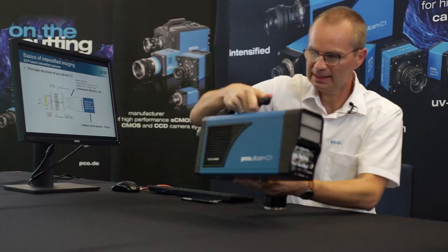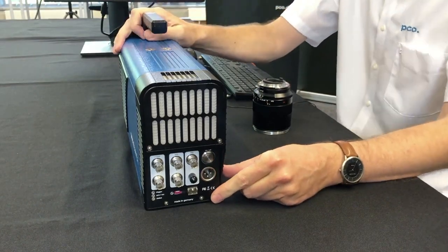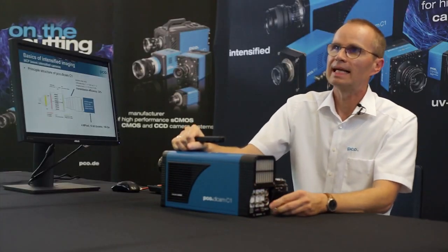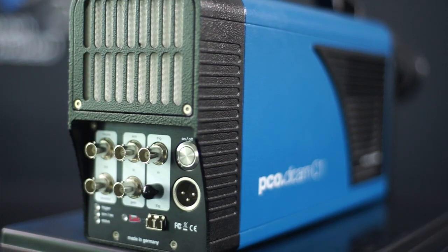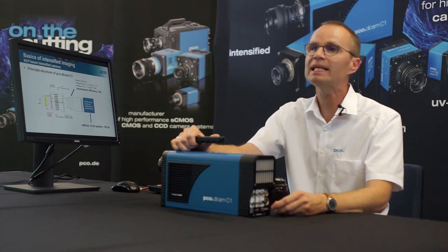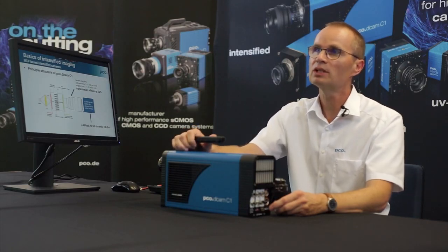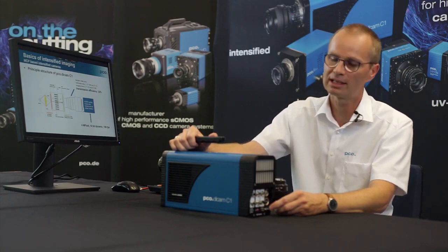Our user interface to the CMOS camera, where we can retrieve the images, is here at the back end. The data interface is CameraLink HS based on 10G hardware. It's a standardized and scalable high-speed camera interface capable of transferring more than 1 GB per second of image data. A big advantage of CameraLink HS is that it's all optical. A multi- or single-mode fiber connects to the grabber card of the PC, which can be hundreds of meters away.